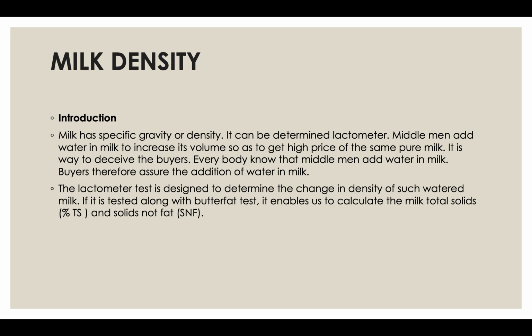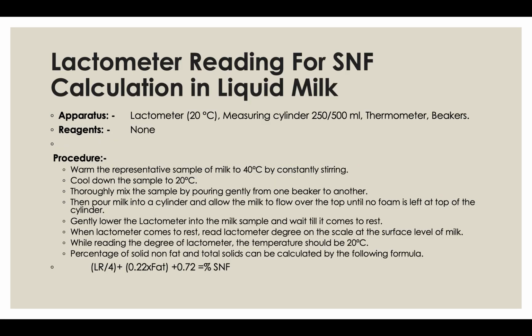The lactometer test is designed to determine the change in the density of such watered milk. If it is tested along with the butterfat test, it enables us to calculate the milk total solids and solids not fat. For this purpose, we need a lactometer, a measuring cylinder of 500 ml, a thermometer, and beakers. No chemical reagent is required for this test.